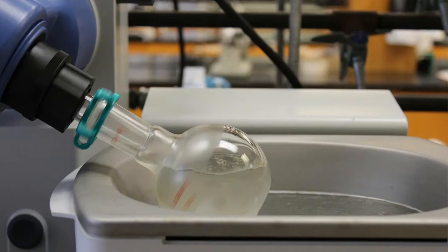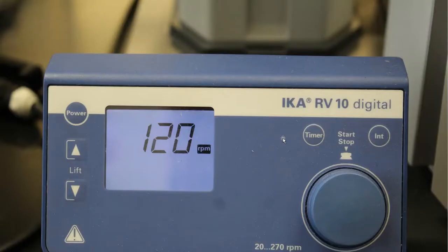Well, there's another setting on the instrument, and that setting is going to go back to this piece that my rotator was at. And if you look to the left, there's a button called lift. And that's what that is. Folks, that's the only other button on there. And if you notice, there's an up and a down arrow, and the lift pointed up goes up, the lift pointed down goes down. That's as simple as it is. That's all that you have to do.